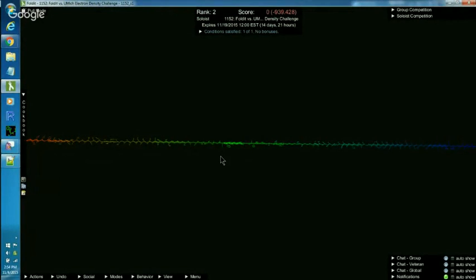Hi everybody, Susumi here. I just wanted to share some tips about seeing shapes in the electron density cloud in Foldit.